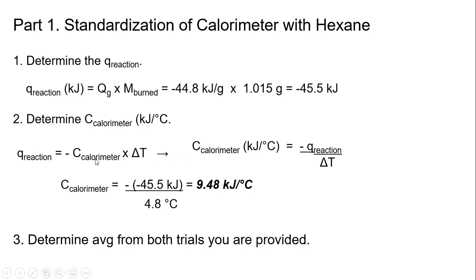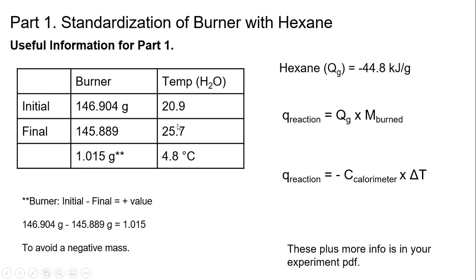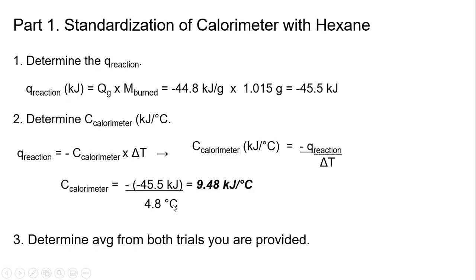So we need to solve for the calorimeter. This is what I was trying to show on the last page a couple slides ago. You have your Q reaction, which is here. And then you have your temperature difference, which, if you get confused on any of this, I have it all on this one slide, and set it up.